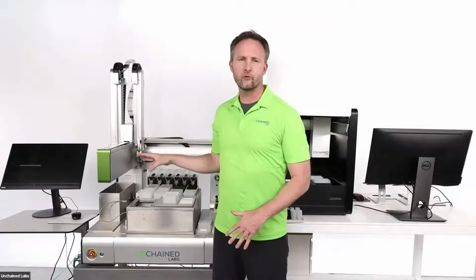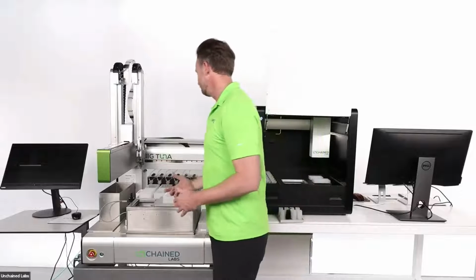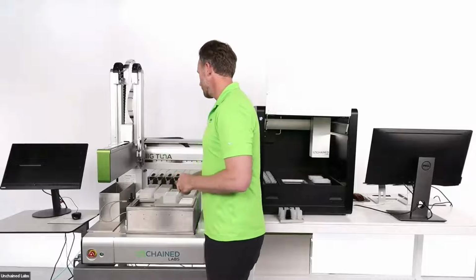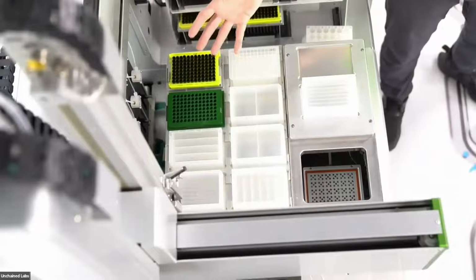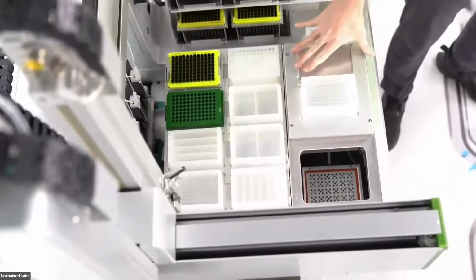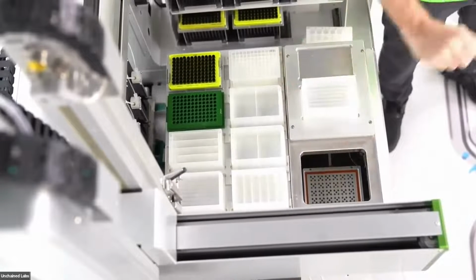I want to take you through the hardware first on Big Tuna and then Unagi to see specifically how those differences look. So here, hopefully Jeff, our videographer magician, is showing you a top-down view. I'll try not to wave my arms around too much. But essentially what you see here is Big Tuna from above. It's a buffer exchange solution, as mentioned. You can think of it as a liquid handler that is designed specifically to do buffer exchange. And so this is where the magic happens.